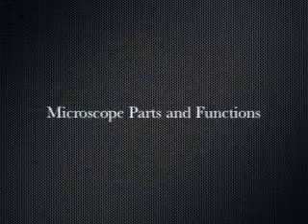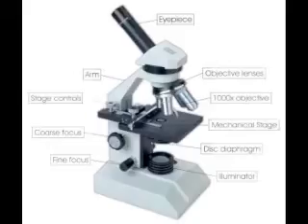Next up, microscope parts and functions. Our diagram here has most of the parts listed for the compound light microscope. Starting at the top, we see the eyepiece, objective lenses, 1000x objective, mechanical stage, disc diaphragm, illuminator, fine focus, coarse focus, stage controls, and arm.